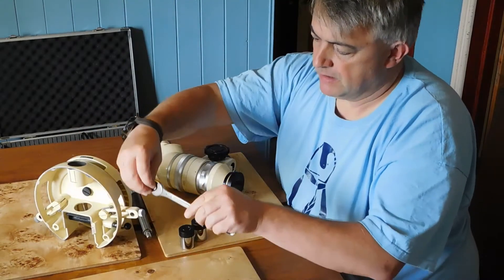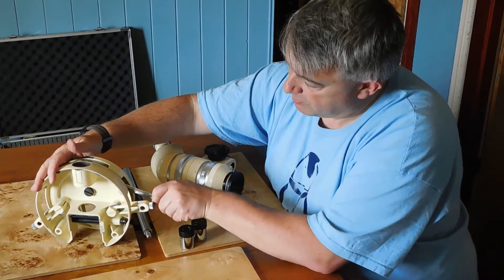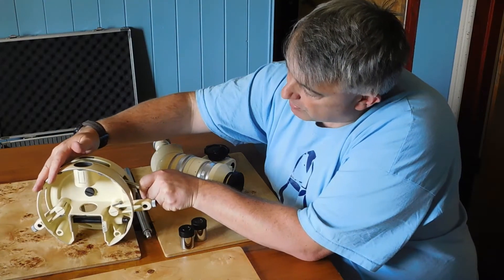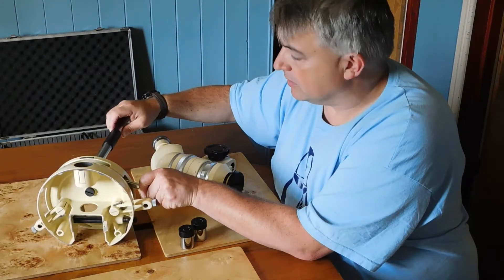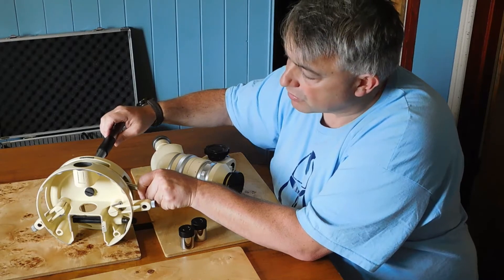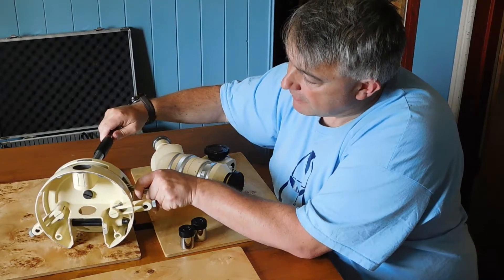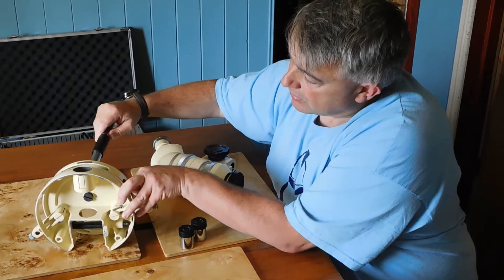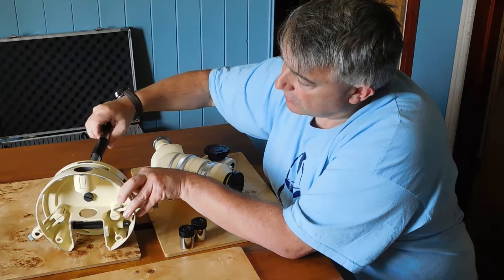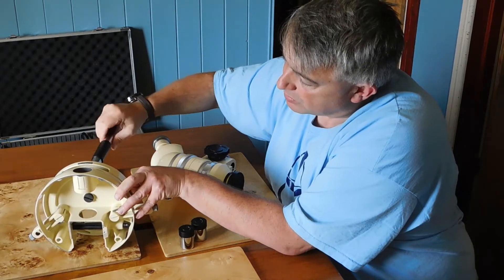What we're going to do is put the spanner into the side of the base and line it up with the back of the hole, then put the post through. If you get it right it should go straight into the nut, and you can hold the nut in place with the spanner.